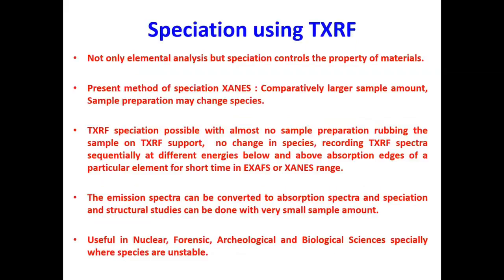Now, this was the story of analysis of trace elements by TXRF. However, in TXRF, we can use it for speciation also. It is required to know the species present in a material, in addition to the trace elemental composition. How can it be done?